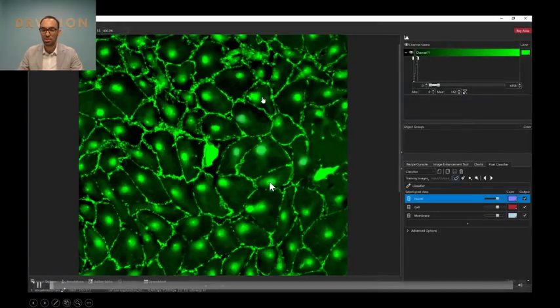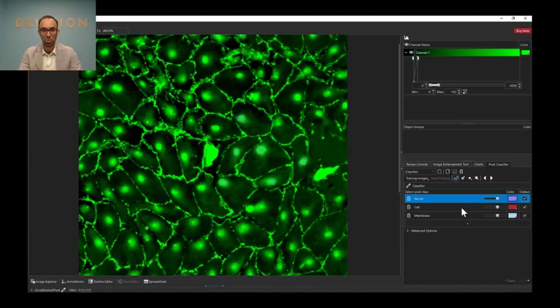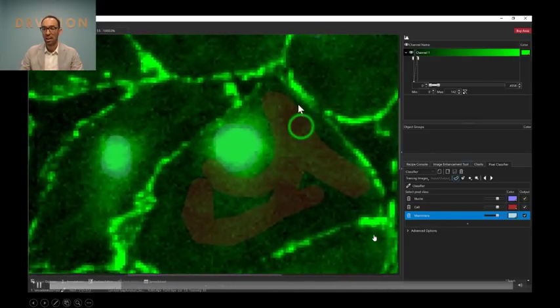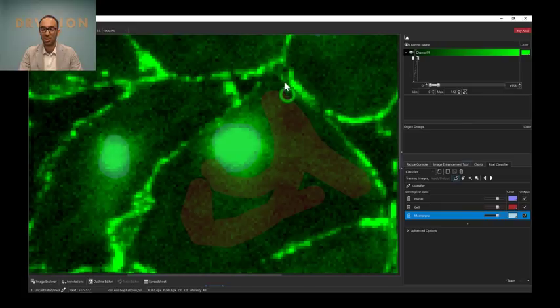So here are some examples now in video format. Here's the teaching, and there will be a live demo in a moment, but I wanted to show you this. So here I'm teaching the second class for the cytoplasm, which I'm calling cell in this case, then the membrane, and another cool feature is you can change with a shortcut. It's shift control and then the mouse wheel, and you can change the size of the paintbrush. And you can see I'm painting the membrane there. And after that, I will turn on the preview, and that's very quick.